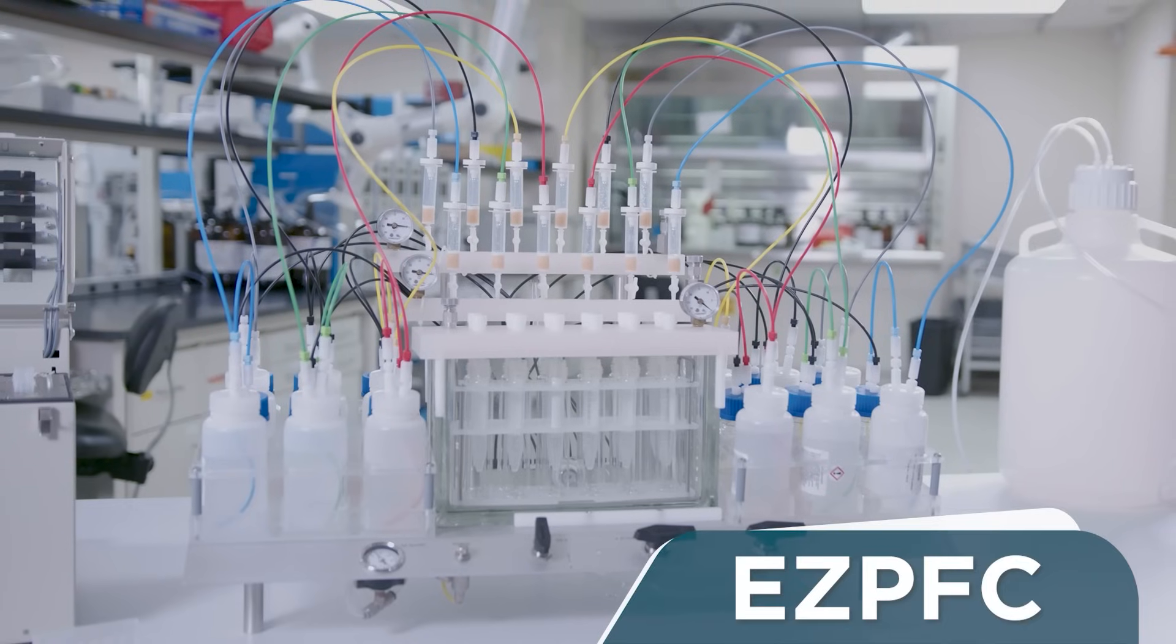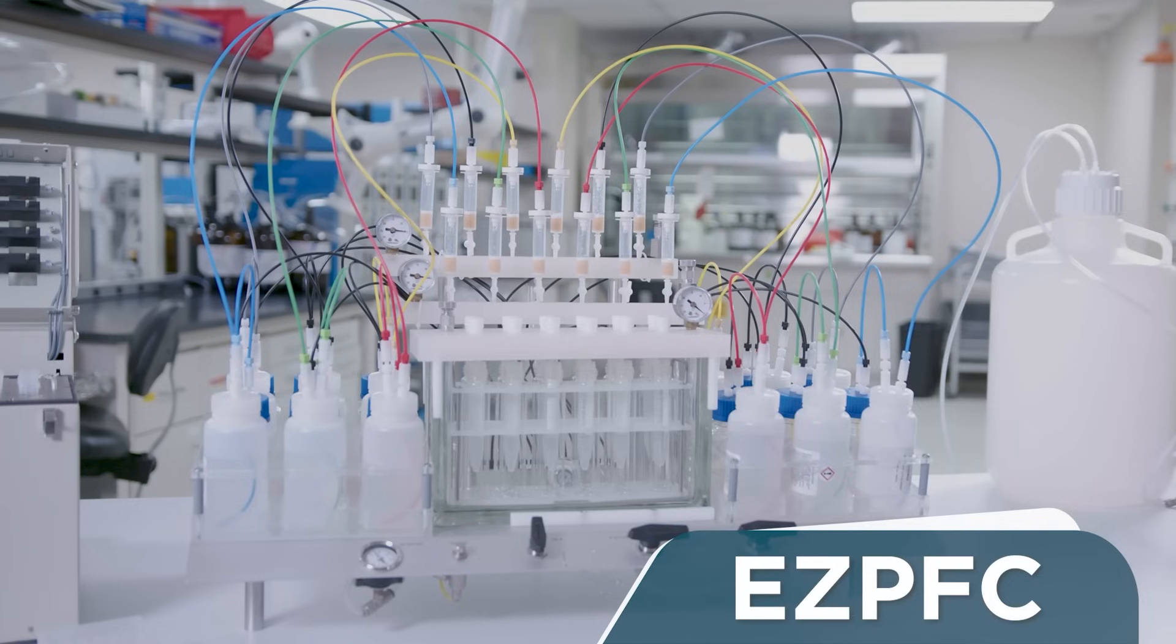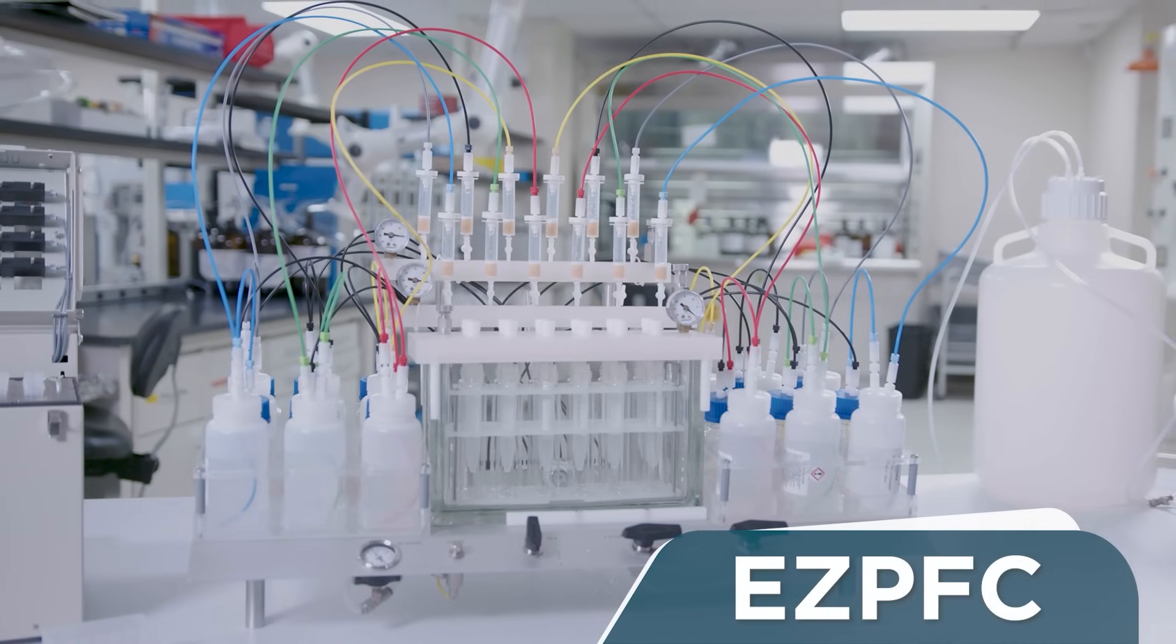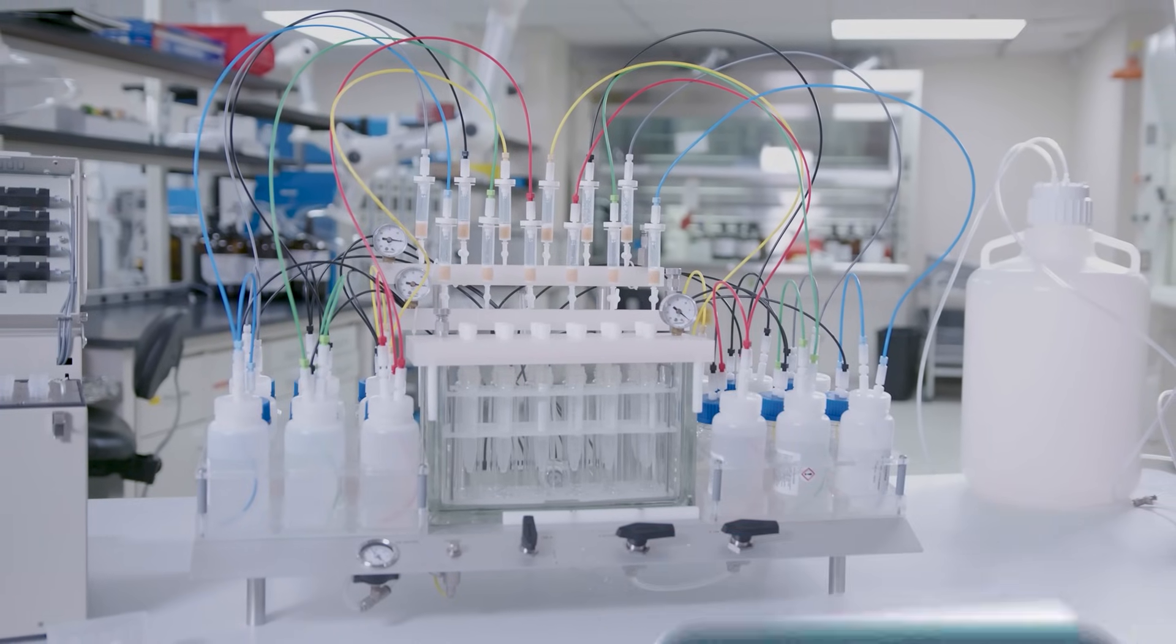The EZPFC Solid Phase Extraction System is designed for the analysis of PFAS, PFOS, and liquid matrices.